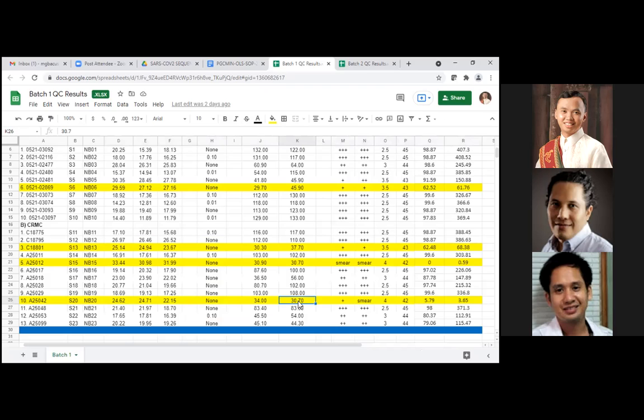So if those segments are still present, then you will have a false impression that lots of intact viral RNA copies are still there, but that's not the case, because if they are degraded, then the rest of the primers used to enrich the viral genome will not work. So that's why these kinds of samples fail.